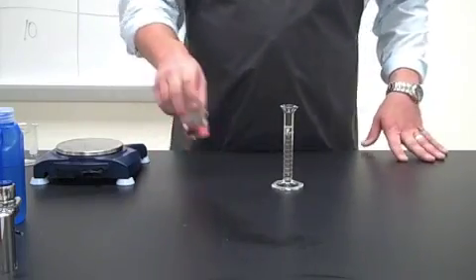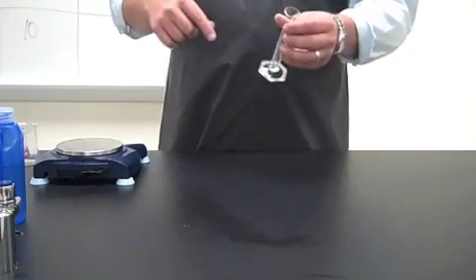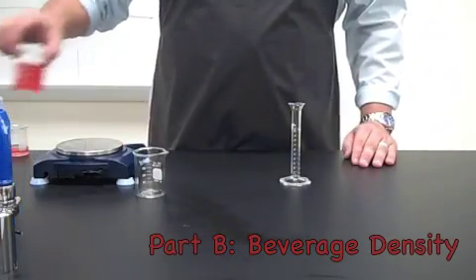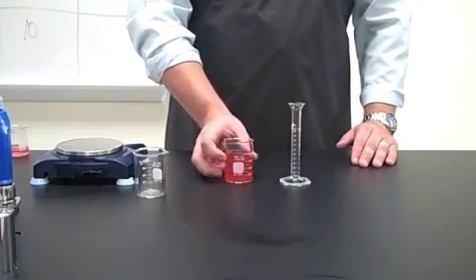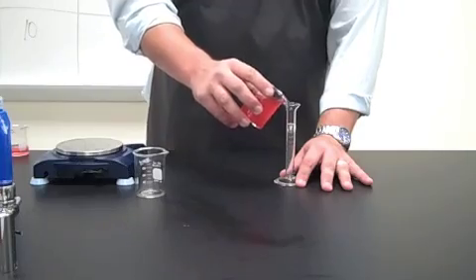Now what we're going to do is take our two unknown samples, and I'm going to give this a quick rinse so that the graduated cylinder is nice and clean for our unknown samples. Now let's take our first unknown concentration of sugar, and this is our Hawaiian Punch, and we're going to do the same process and fill up 10 milliliters in our graduated cylinder.